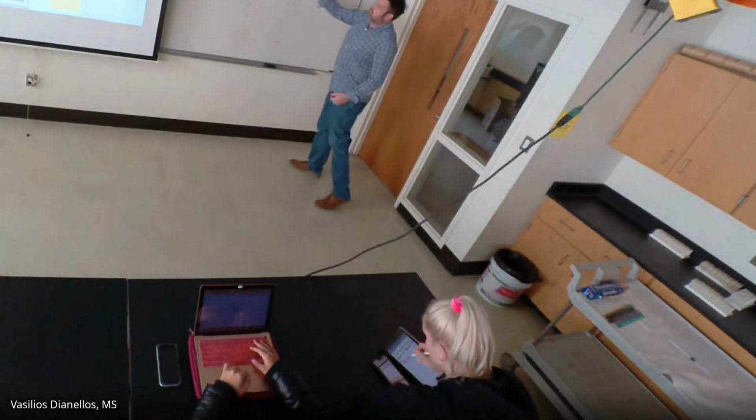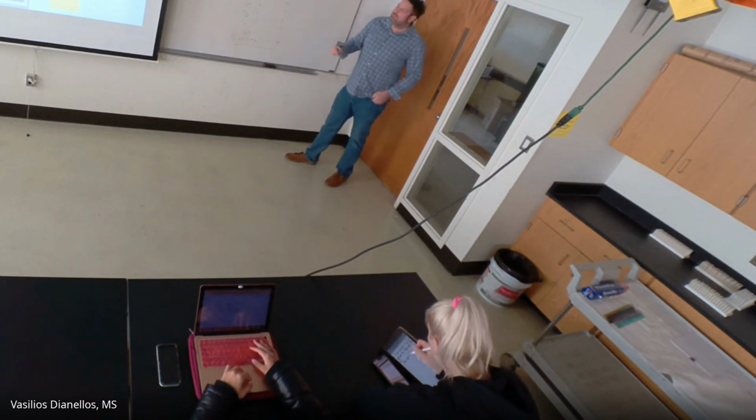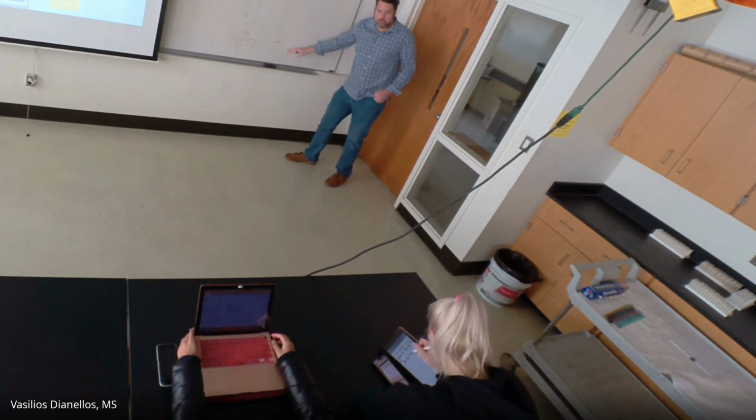But there we go. So that's why we take it every 5 minutes, because you can't look at just the beginning and the end. Maybe you can, but you might have a situation in your data in which you need to look at the whole picture.